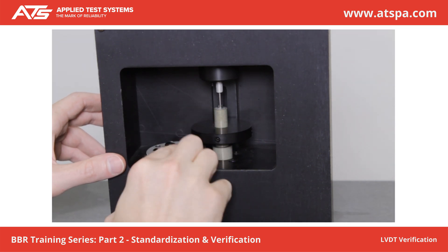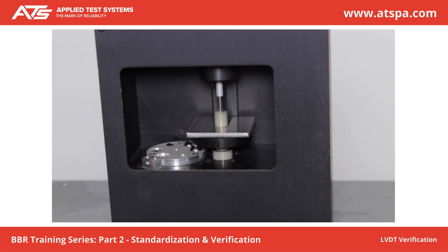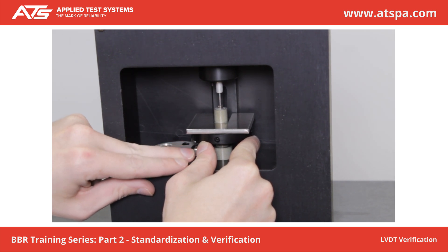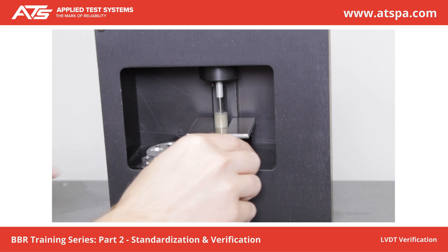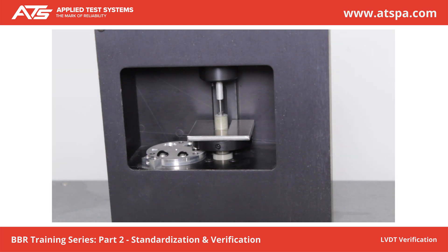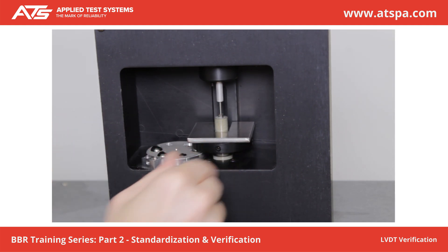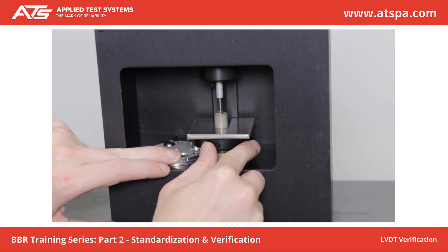Raise the loading shaft with the zero regulator. Place the step disc in the zero position. Lower the shaft using the zero regulator until the pin touches the surface of the zero position. Place 100 g weight on the weight pan. Compare the measured displacement to the known step disc location. Repeat for each step disc location. Dimensions should be within plus or minus 0.001. Mark Verification Complete if observations are satisfactory. Press Next.